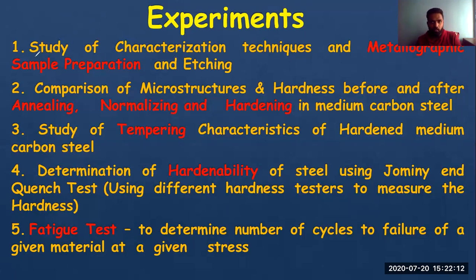Okay, so what is the first experiment? I already informed you. Just let me shift my screen. It was about metallographic sample preparation and etching. I will inform you what etching means afterwards. Initially, what is your first experiment? Metallographic sample preparation. Why do you prepare the sample?